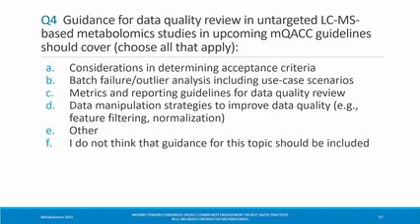And it's really interesting because they've got specific mixtures, and one example is something called Disco 7, where it's got 7 compounds in there, and each of those compounds has a specific purpose to test the system in different ways.